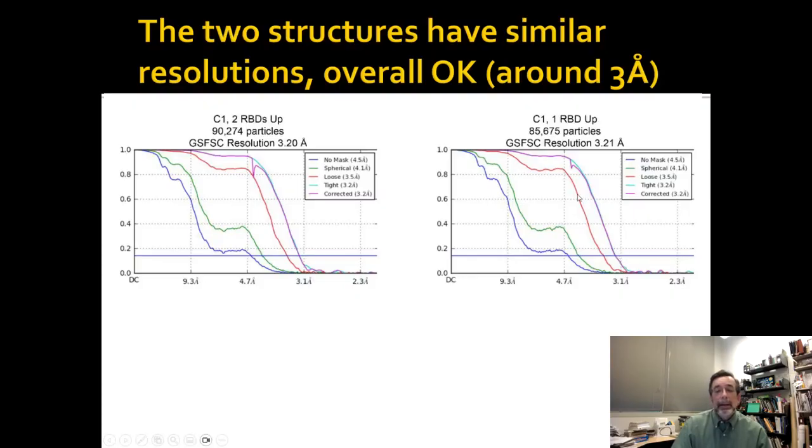So you can get an idea of the whole molecule following the same pattern. When you see the blue and green lines over here, you have one part that has trouble with resolution, bad resolution, and then another half of the molecule that is much better. But they actually use that in their computations to smooth it out. Basically, this is the percentage of the molecule at that resolution, and you expect this to show this sort of S shape.